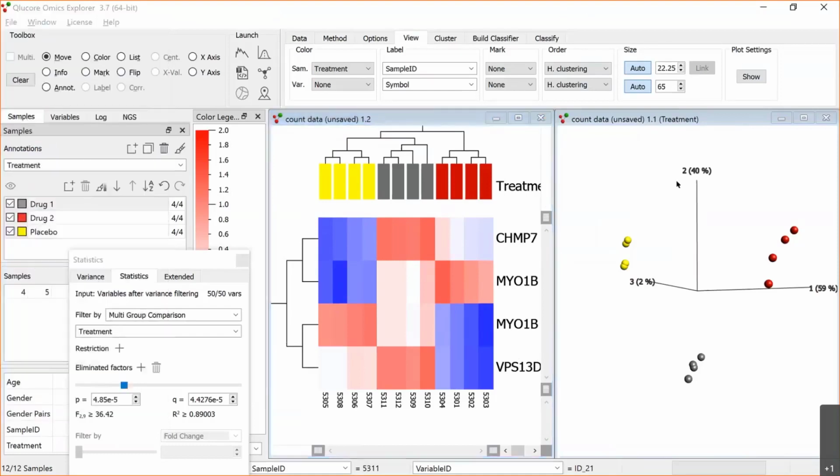So let's have a look at the questions. So I got 2 questions here, I think. The first one is, what are the differences for these 3 different normalization methods? Yeah, I think you need to Google that, because there are small differences. They basically, I would say, do the same thing. They account for the gene length and the read depth.